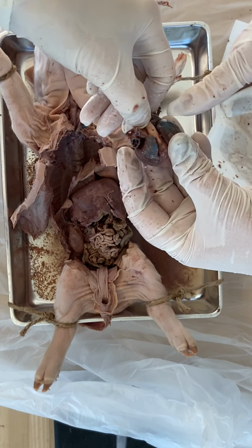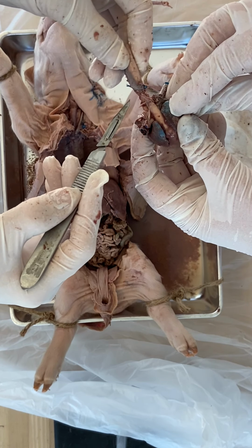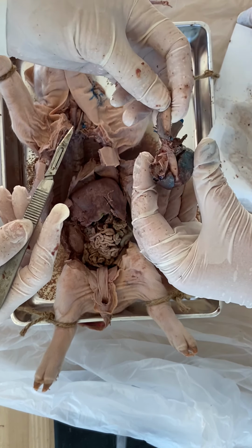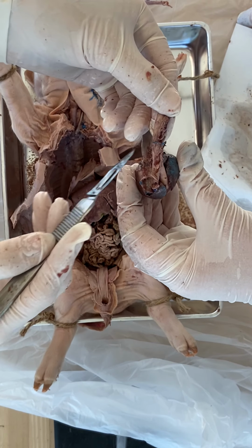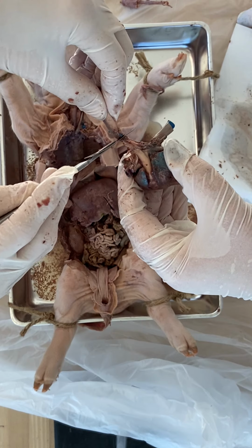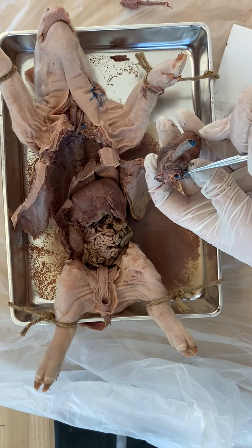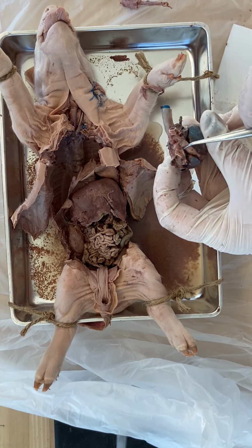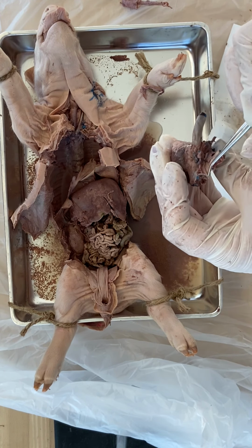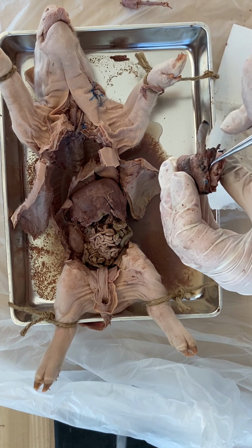This is the pulmonary artery. Yes. Is that the pulmonary vein? Interesting. I'm going to cut it. There we go. So pulmonary artery. Where's the aorta gone? We have it up here. It's interesting because I'm not seeing much red at all. Mostly just seeing blue.